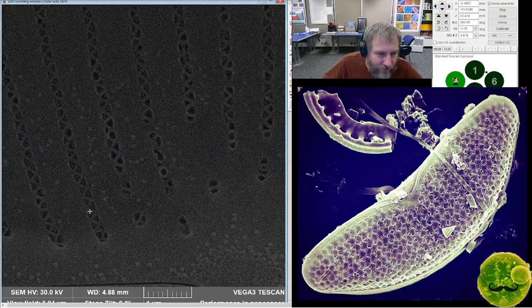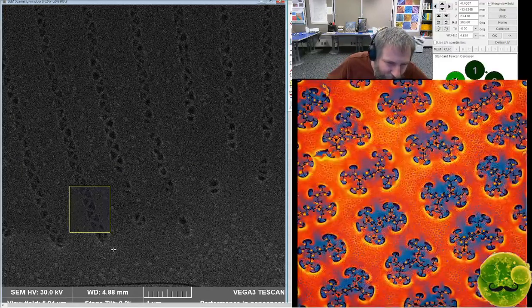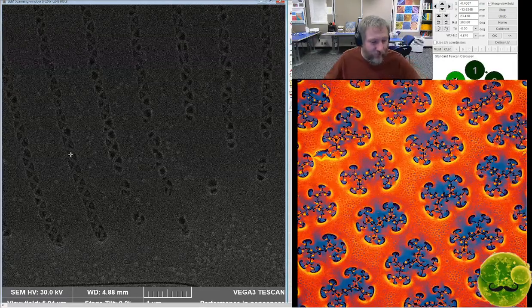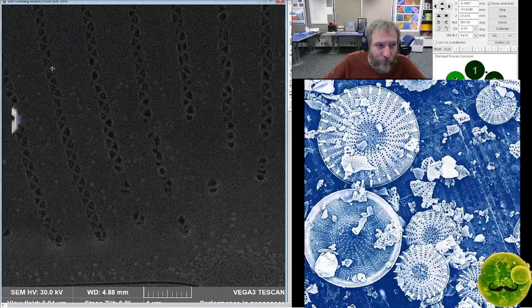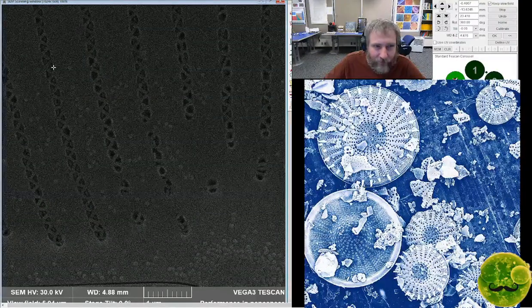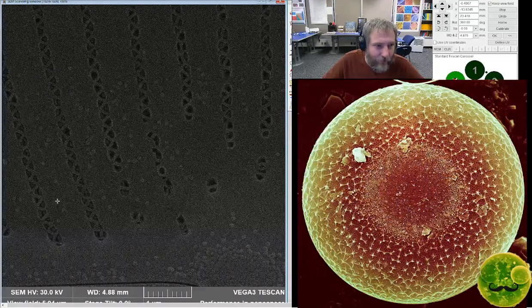Look at the sort of braided nature of this striae. This is what's called biseriate, by the way. So we had a uniseriate as an example for striae. Biseriate striae, there's two striae in the row, two different kinds that are adjacent to each other. They alternate back and forth. So this sort of braided looking pattern is biseriate striae.